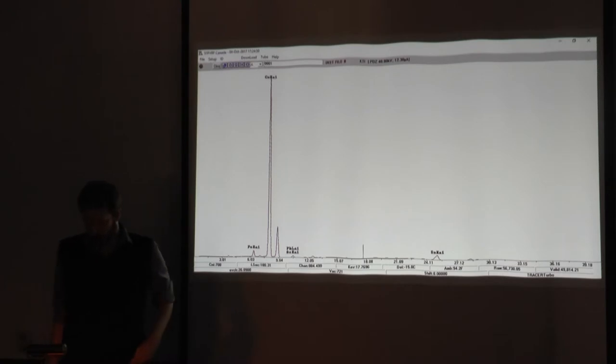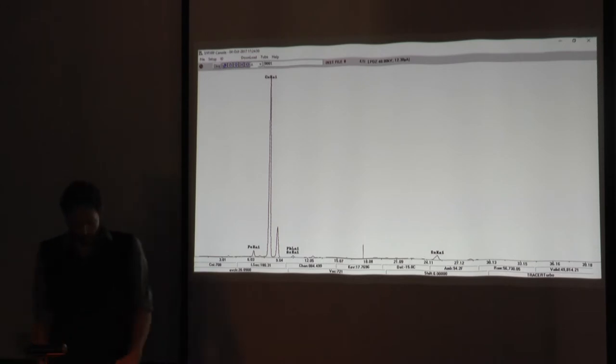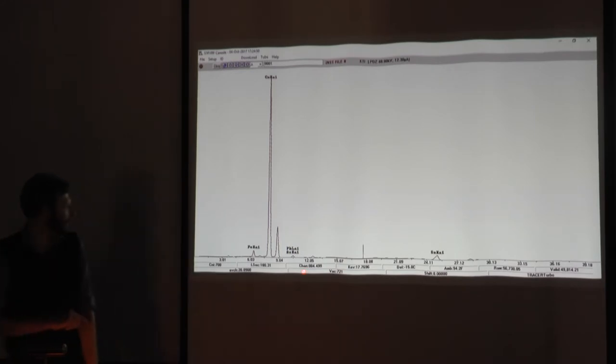Once we get the results, they come to us like this, as a spectrum. We have to manually identify every element in our sample. The biggest peak in this slide represents the K alpha of copper, and the smaller peak is the K beta. So this one, which is unlabeled, the K betas are not labeled. Sorry, lost my place. As you notice, the labels for lead and arsenic, Pb and As, are overlapping right here.